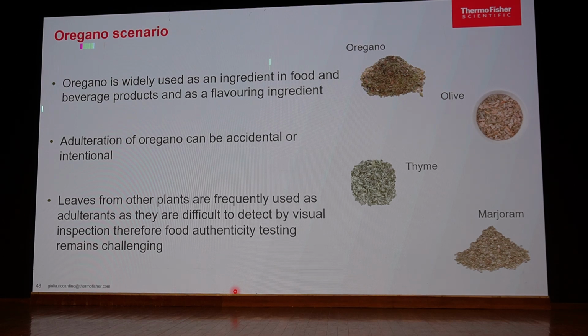Similarly, we did earlier work on honey adulteration. Maybe you have heard that 3 years back there was a big incident, and how to recognize that honey adulteration. So we did the same approach on LC-HRMS, and we were able to find the marker compounds which showcase that chemically your sample is not in pure form, because something external has been added into it, either rice syrup or corn syrup. Based upon that you can recognize and define that the material is not pure.